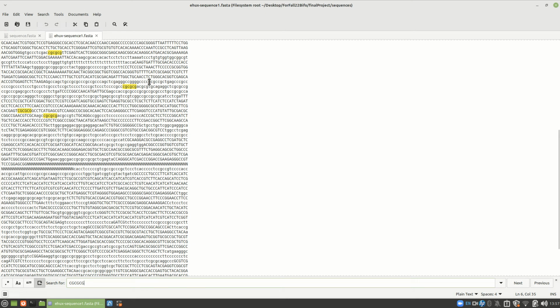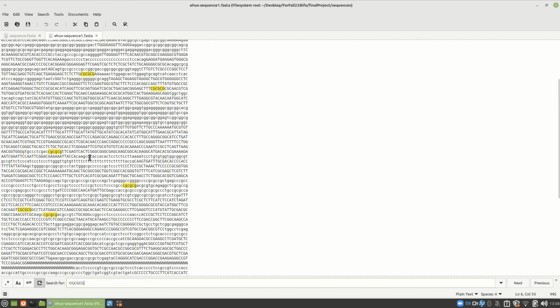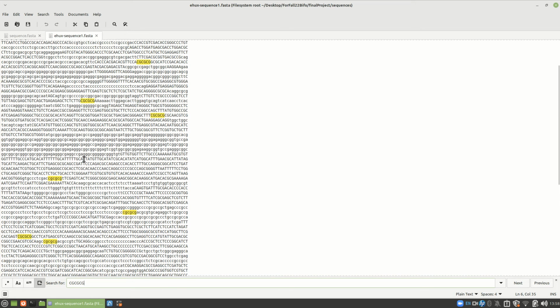So you've got 3 or 4 of these here. This is probably your promoter. So if you're looking for a promoter region, this is probably your promoter region, and then there's a gene after it down here. So that's how I would start out if you are in sequence 1. It's not perfect, but that's what I'm trying to show you, is that this is not an easy thing to do. The computer went through, and I'll tell you how I found these.